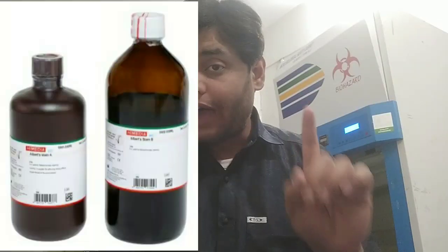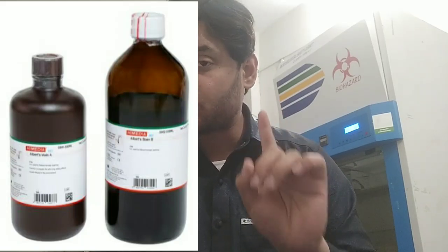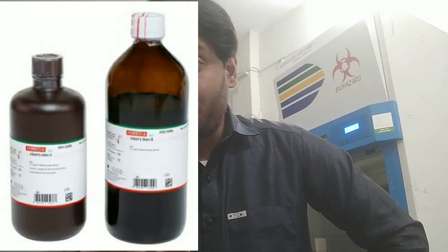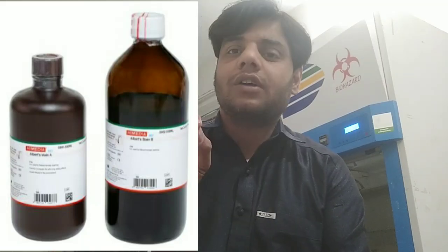Then you will take the slide onto the staining rack, and you will stain it first with Albert staining solution A. You will stain it with Albert solution A for 7 minutes. You will wait for 7 minutes. After 7 minutes, you will discard this solution. Remember, you will not wash this solution with tap water. You just discard it.